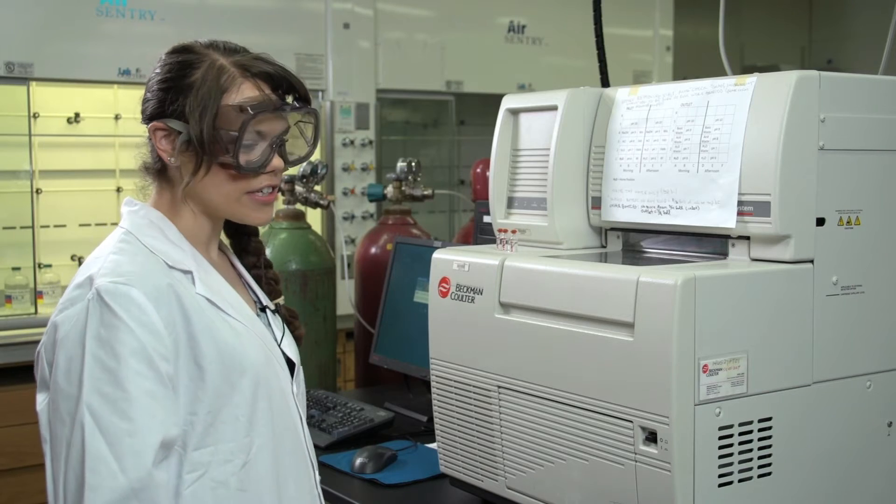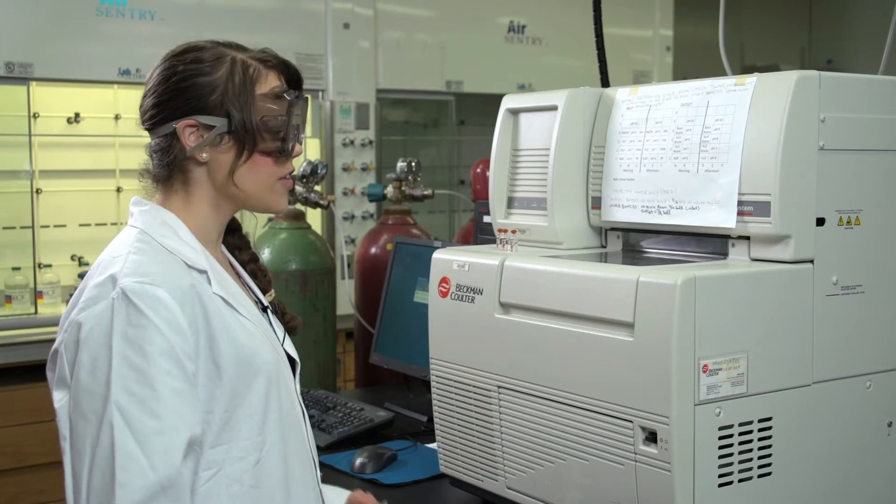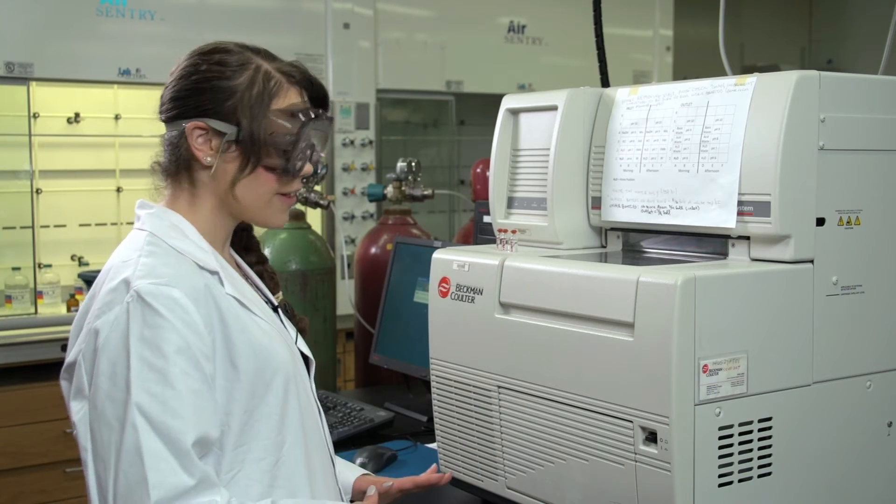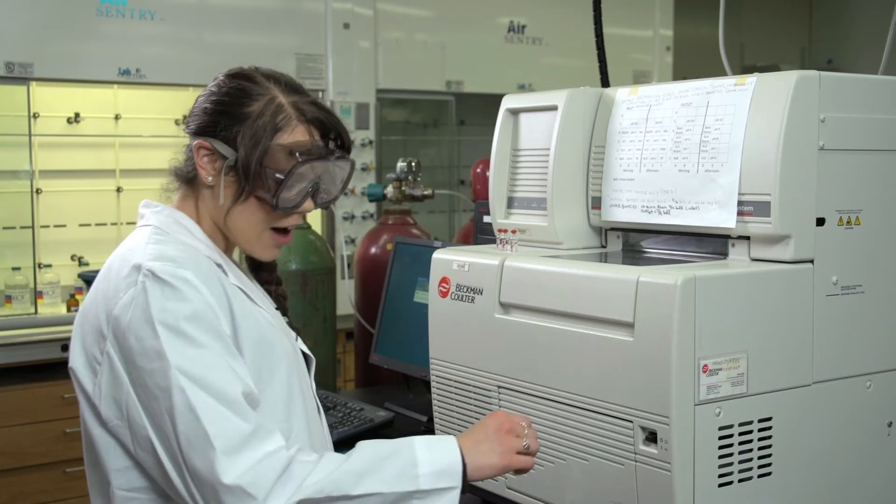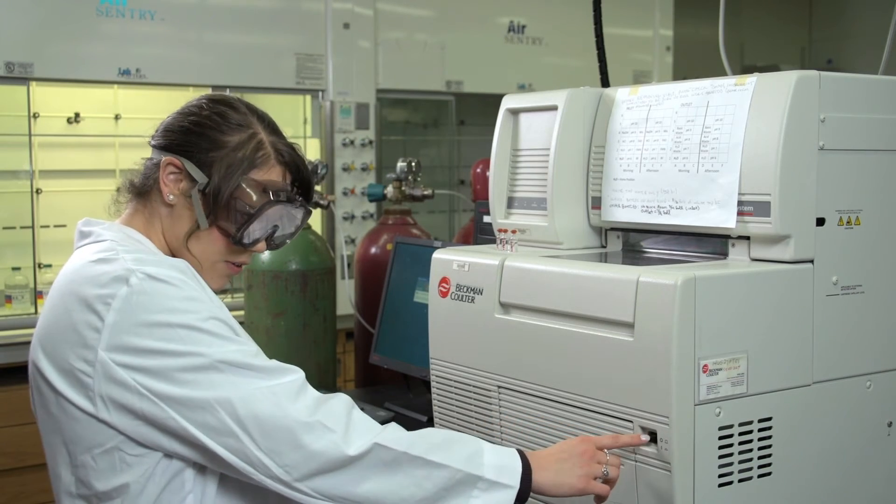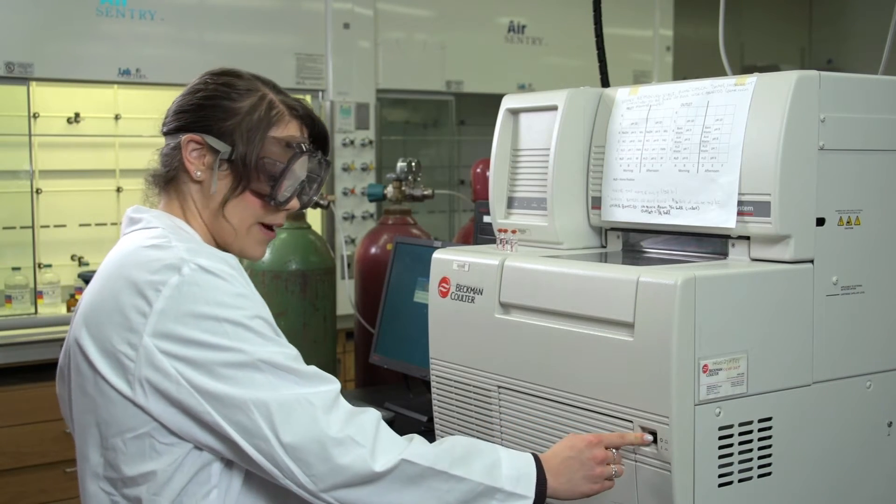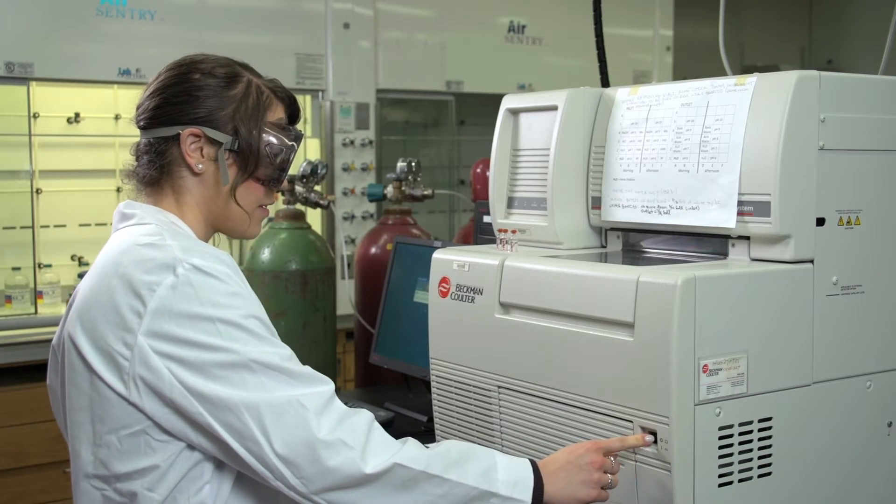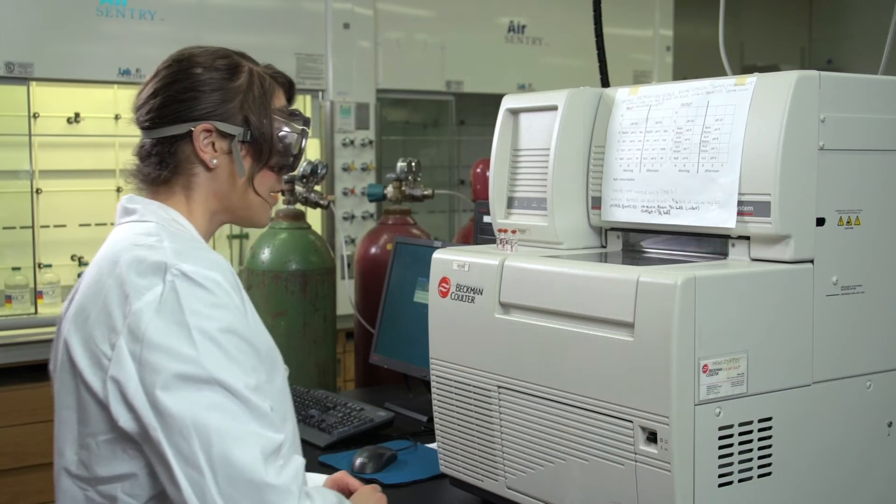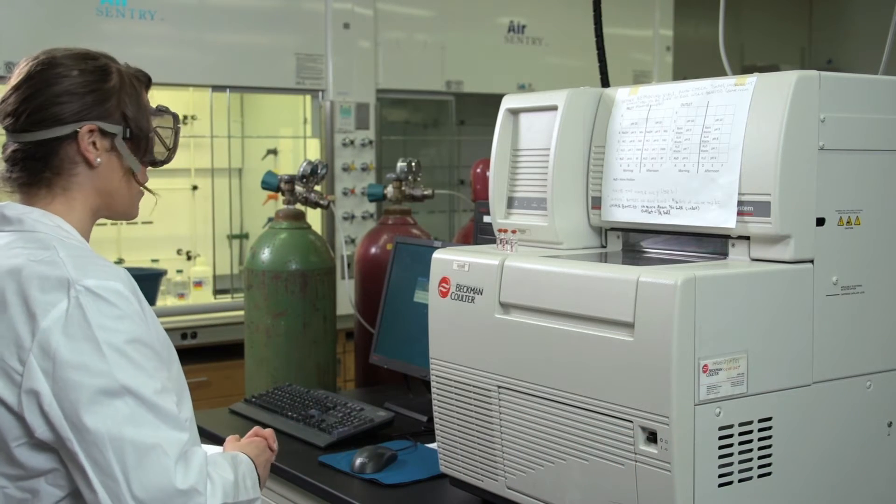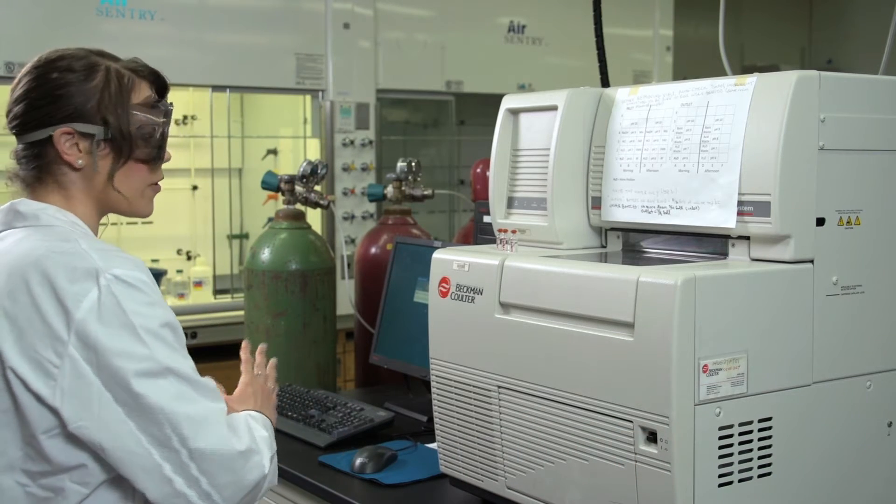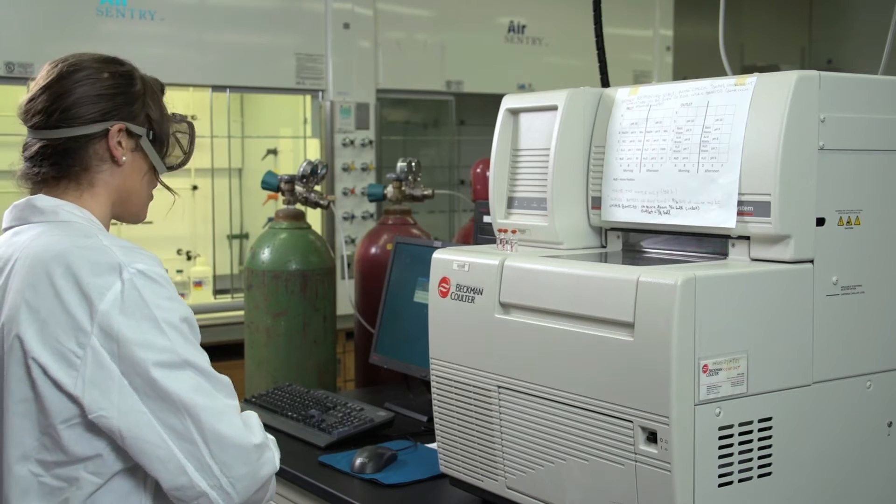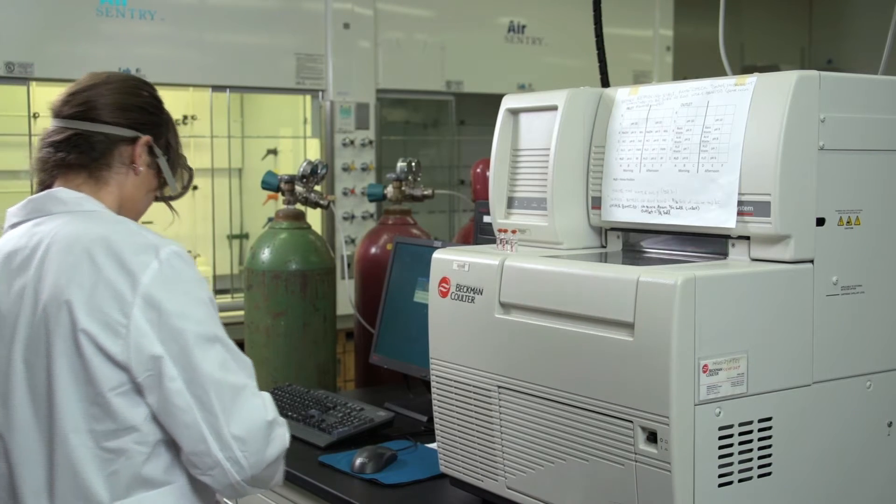Once you're done filtering all of your solutions, you can turn on the instrument. All you need to do is to push in on the button. It's very important that you turn on the instrument before you open the software on the computer.